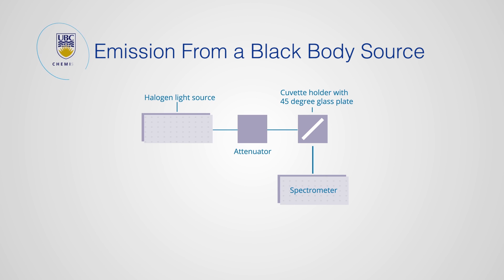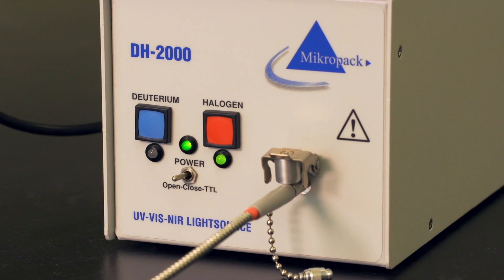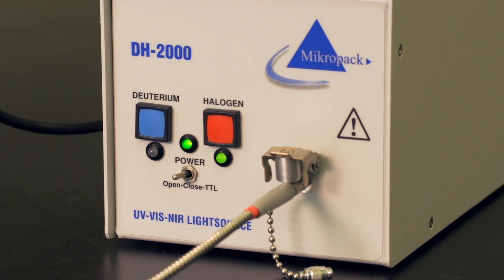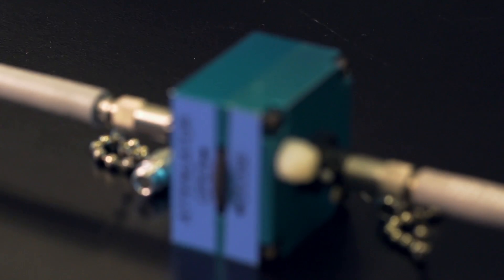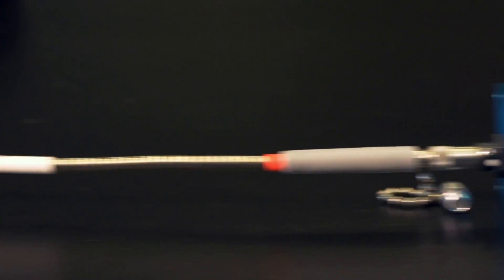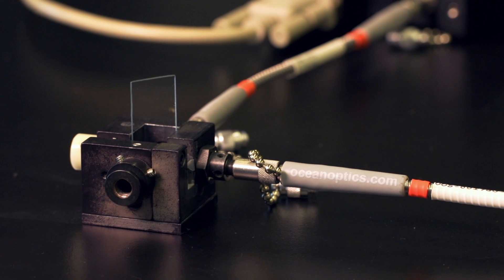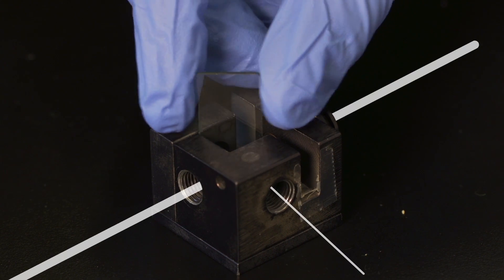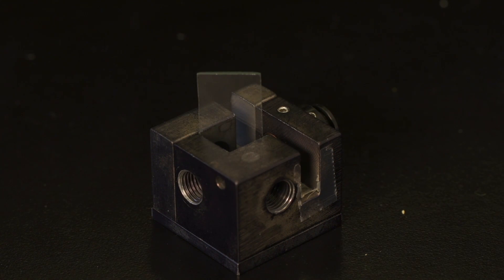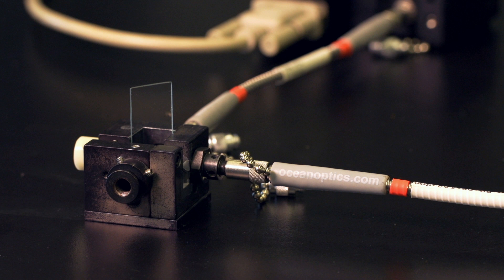This configuration is used to collect a reference spectrum that will later be used to correct the measured fluorescence signal. The light source used here is a tungsten halogen lamp. The light beam travels through the fiber optic cable, reaches the attenuator, and then the cell. A glass plate placed at a 45 degree angle redirects a small fraction of the light beam perpendicular to its original pathway. The light beam then passes through a collimating lens, through another fiber optic cable, and into the spectrometer where it is detected.